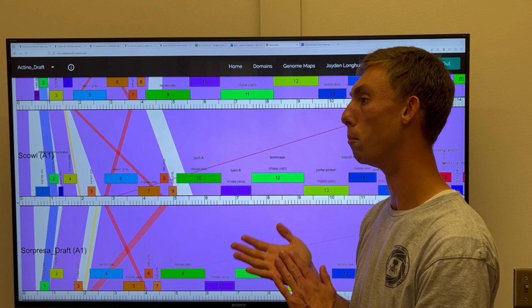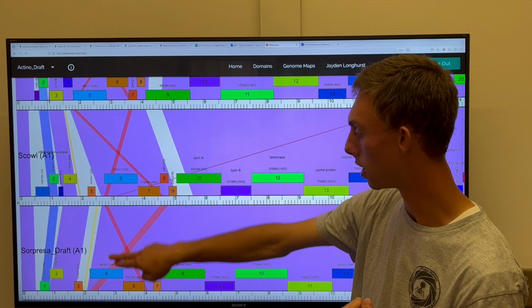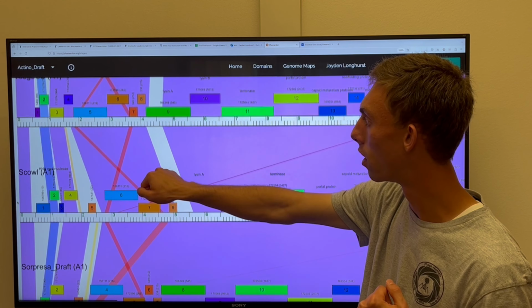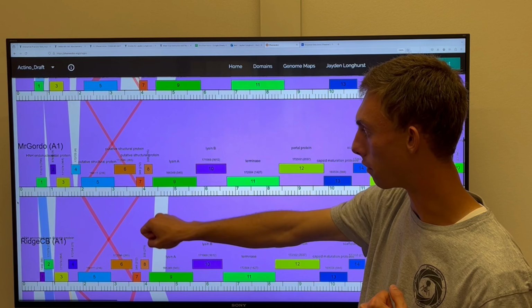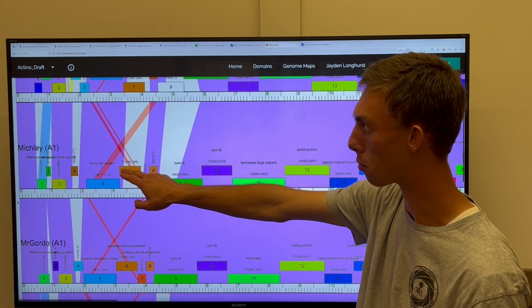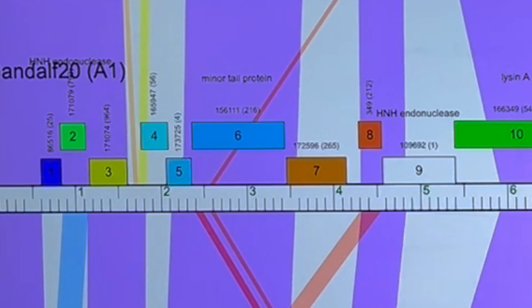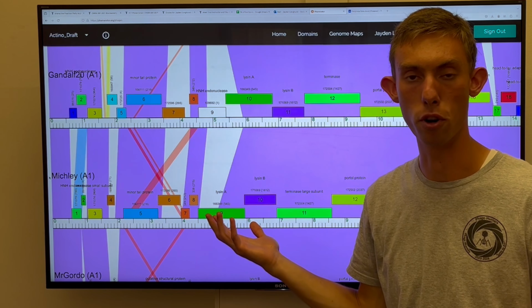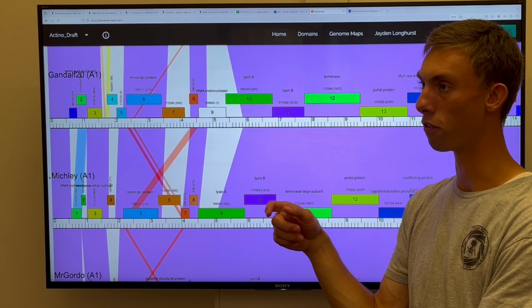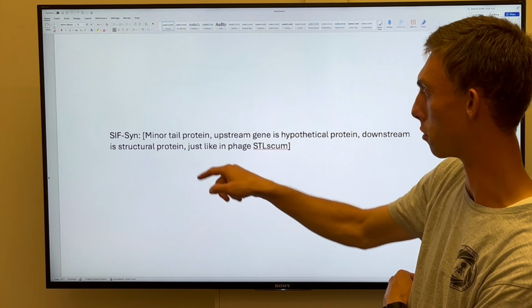So if you look here, you're going to want to see what the function is. This doesn't tell you the function on your phage or this phage. So if you scroll up further, often you'll be able to find one to tell you this is putative structural protein, which isn't a very strong call, but minor tail protein is a little stronger. You see it's there as well. So there's one up above. So minor tail protein seems to be what Phamerator is calling this. So in your function, in that other screen that we have here, you put minor tail protein.